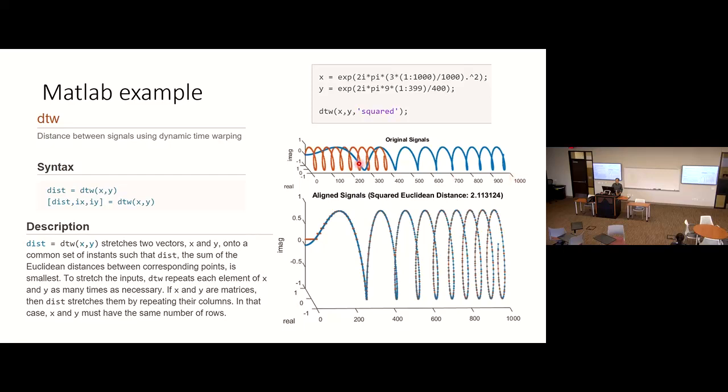to allow them to align, okay? To introduce spaces between sequences to make them matched. Okay, so what's the match? If you look at this blue curve, after this dynamic time warping, it becomes stretched and matched with this orange curve. All right, so that's the technique we will use to finally align these trajectories.